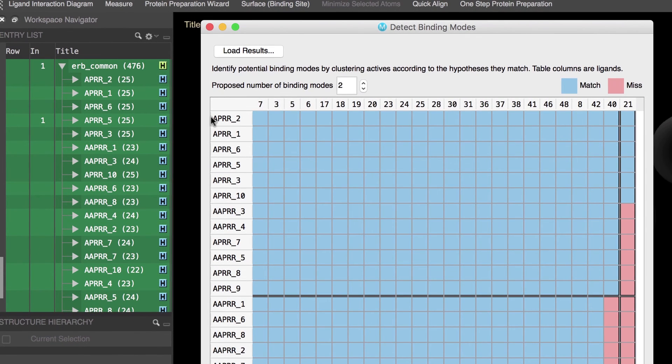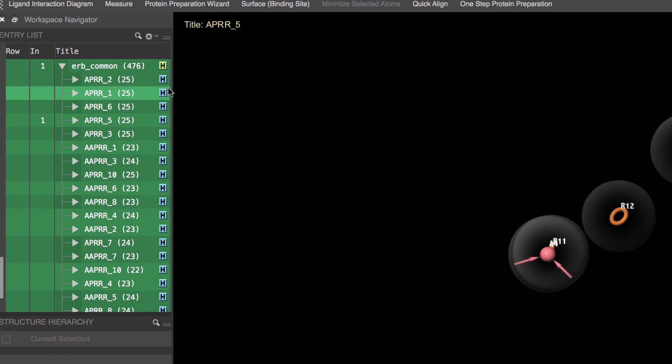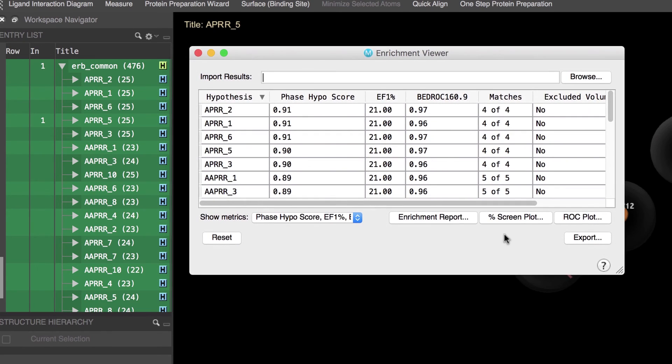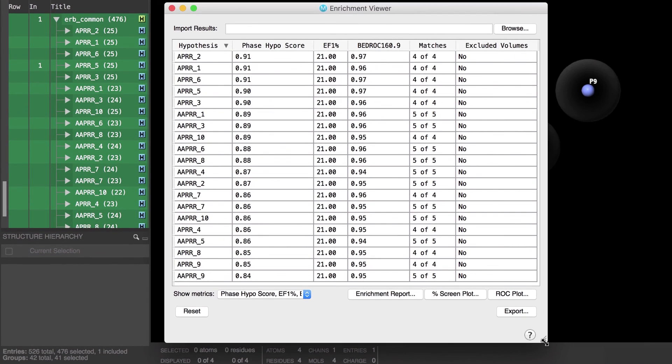Also since the phase hypo score was used for rank ordering the hypotheses during the pharmacophore perception process we can use the enrichment viewer to analyze the enrichment performance and gauge how well a given hypothesis did at retrieving the actives against the glide decoy set.